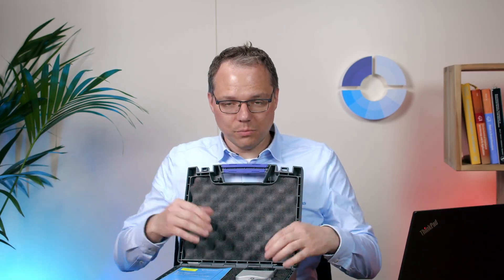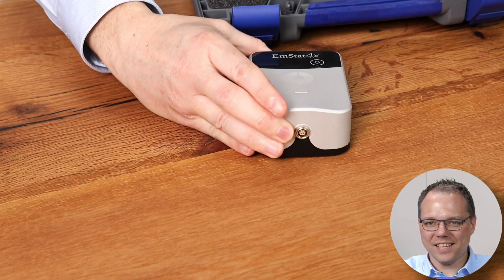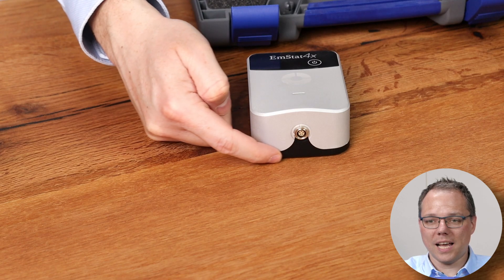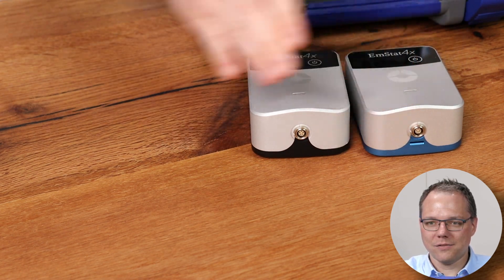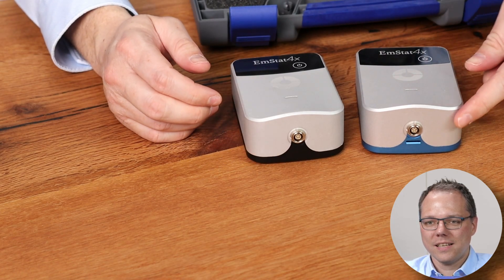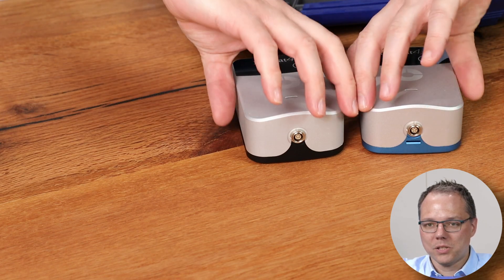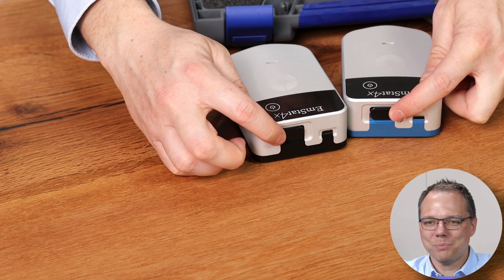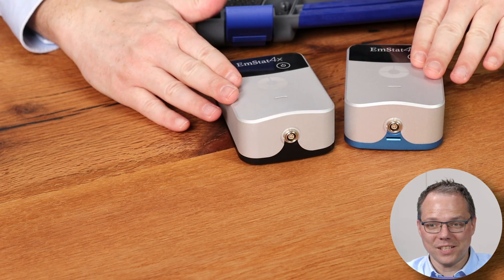Well, the first thing is — and that's no surprise — an EmStat 4X. In this case you can see this is the high range version, you can tell because it has the black bottom. Here for comparison is the low range version. The difference is this one has a connection for screen printed electrodes, but both of them have an auxiliary port that is protected by a dust cap. Of course both of them have battery and Bluetooth integrated.